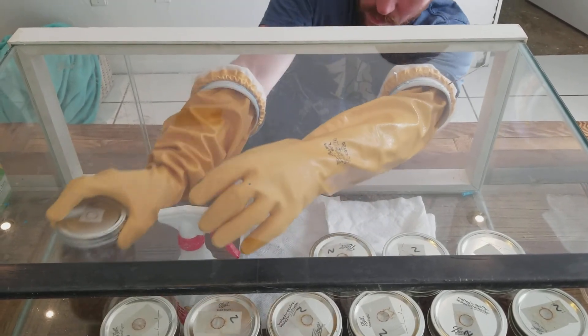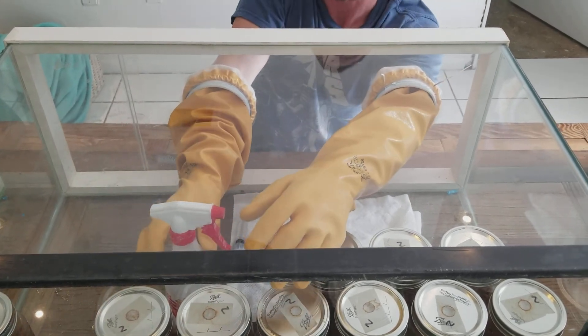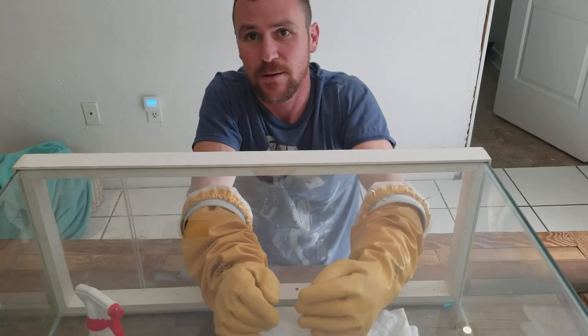And then I'm going to do that nine more times. I'm going to get started.